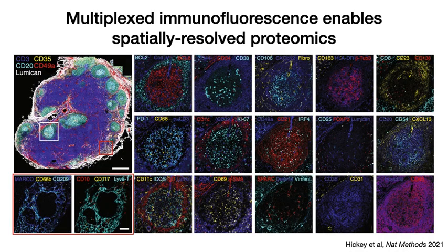We start with some high-level motivation for our work, which arises in the context of experimental design for multiplexed immunofluorescence. Multiplexed immunofluorescence refers to a suite of related technologies, all developed in the past few years, for measuring protein expression in situ at subcellular resolution. These approaches all entail staining a tissue sample or cell culture with antibodies complementary to target proteins of interest, and which have been conjugated to a fluorophore, and then inactivating the fluorophore and repeating this staining over several cycles, permitting simultaneous imaging of up to high tens of different protein targets within the same sample.